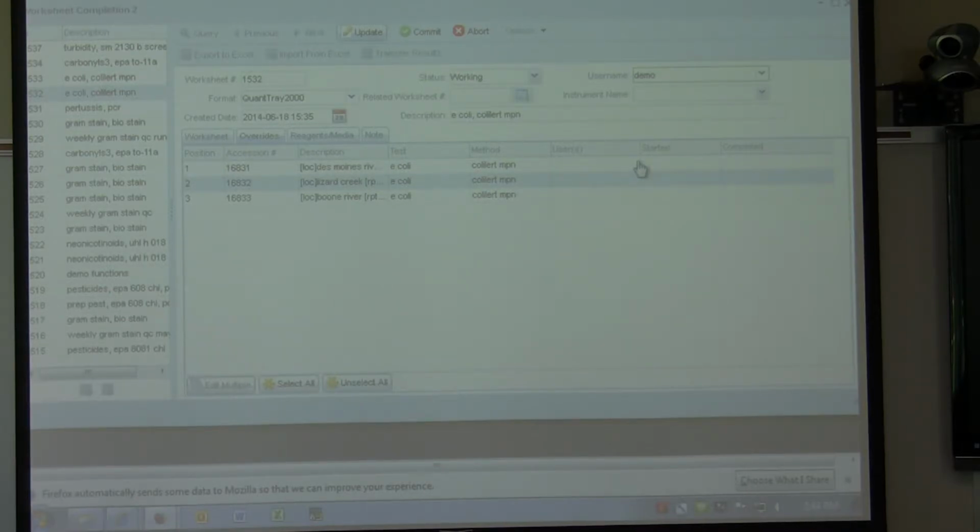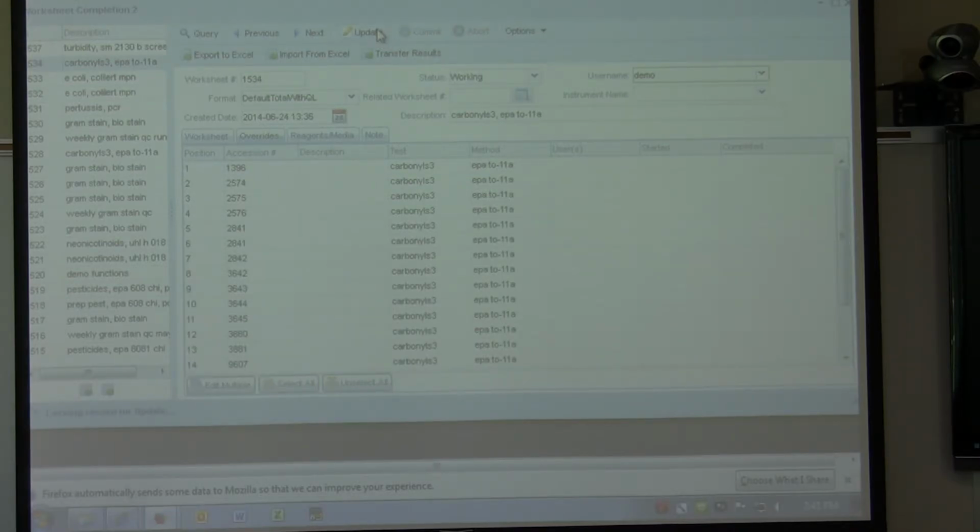Something like a little screwy. I tested all that. Do those work? And the user's not working. Huh. Try a different one. Let's try this. I'll have to check that field. That should be working. Yeah, it was working last time I looked.